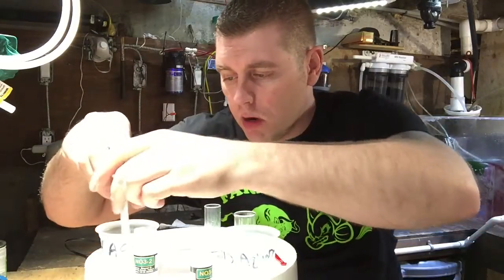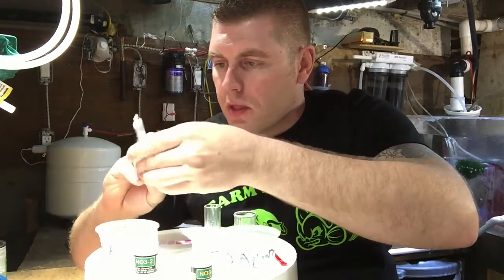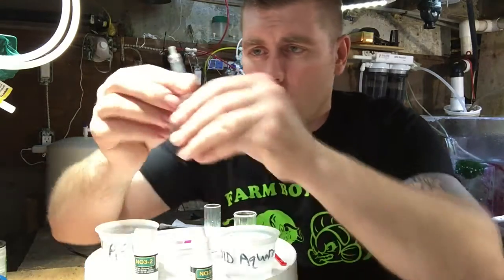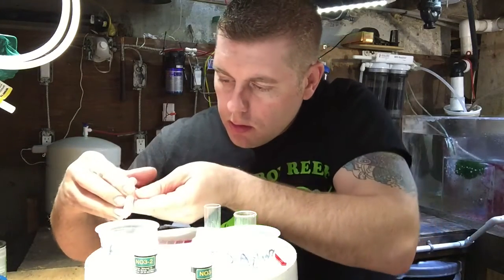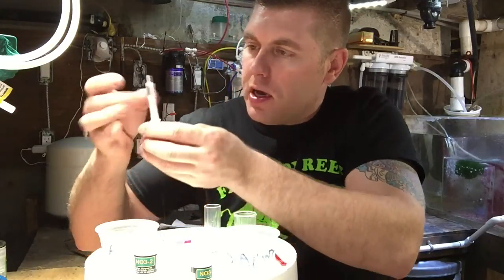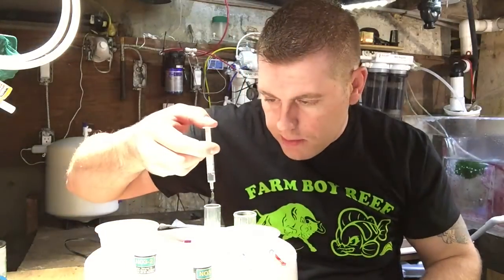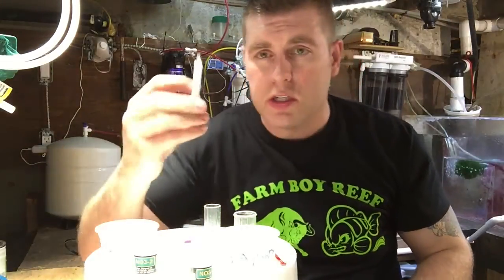I have a second syringe so there's no cross-contamination of the water. Now I have my new tank water from my tank — we're going to test my tank tonight and see what we're at. Fill this one to the one milliliter mark as well, then put the syringe away.